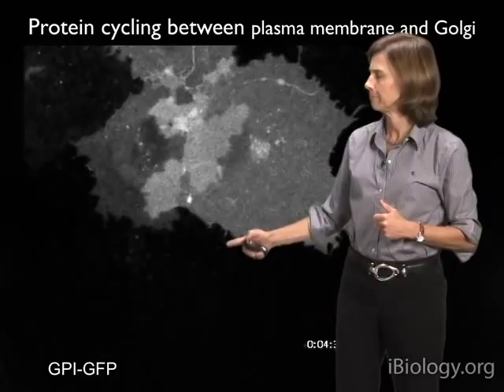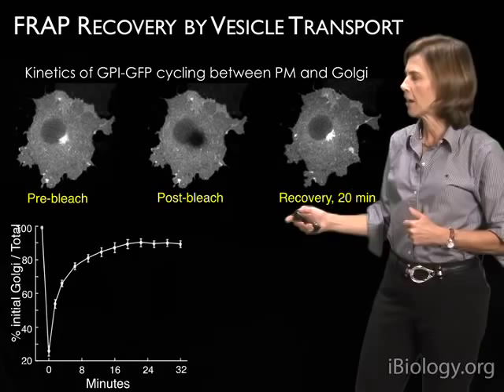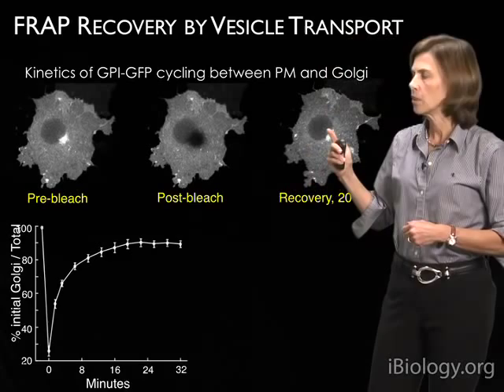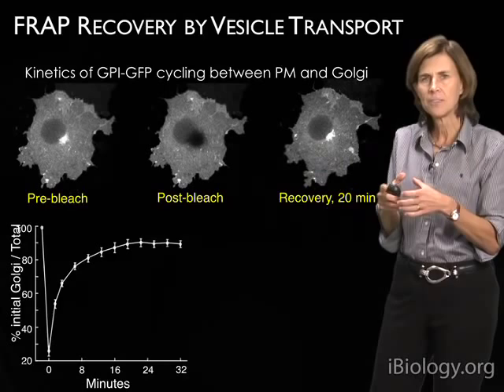Now, in the case of this recovery that we're seeing here, we can go in and actually quantify the kinetics of this recovery, as shown in this graph down here, and from that, get insight into the kinetics of movement of vesicles that convey the GPI-anchored protein from the cell surface to the Golgi apparatus.